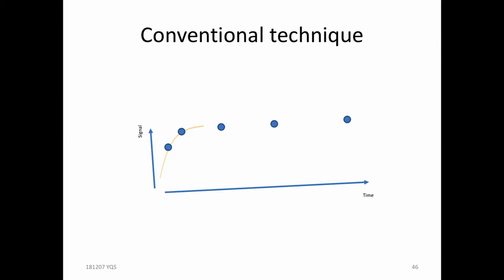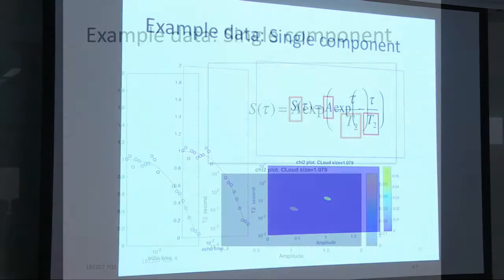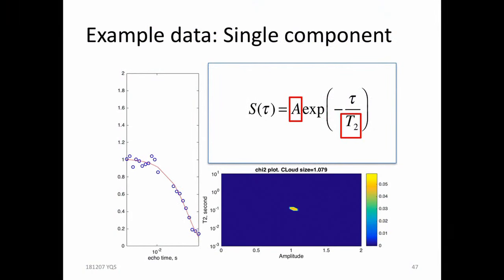So how can you design a system that when this is the saturation, it will put all these variables in here, right? Trying to focus on what is the right parameter used. I'm sure this is not unique. For any measurement, you will always do this. Say measuring temperature, there are many instruments that automatically change the scales and measure something more accurately. But for NMR, this hasn't been done before. And so this is a simple example.